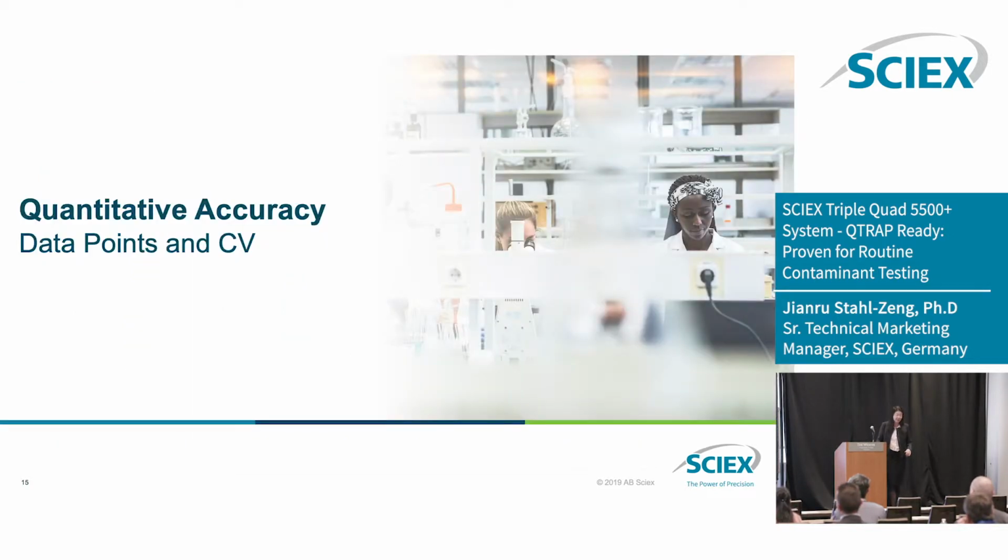And of course, next step, we also look at the quality, the accuracy of quantitation. We look at the data points. What we did is totally about 1,000 transitions, 500 something positive, 480 negative.